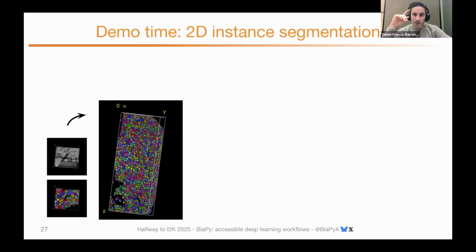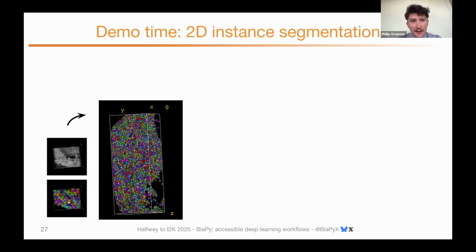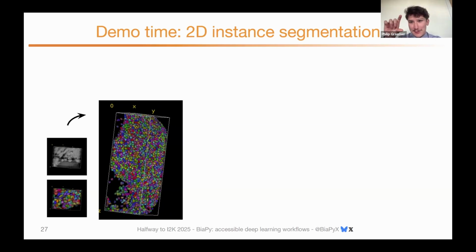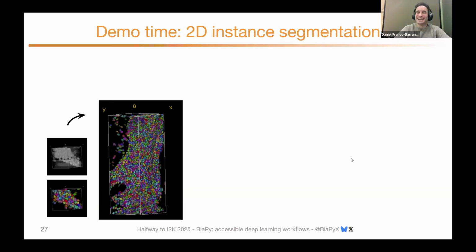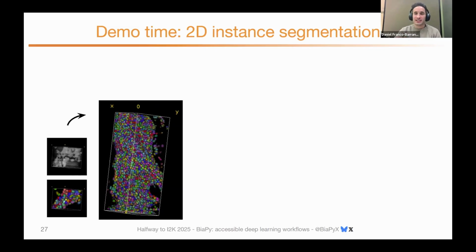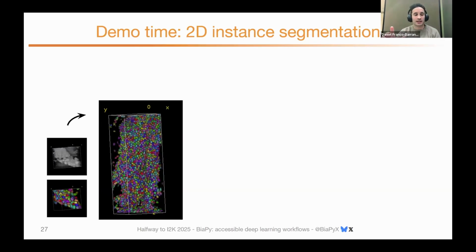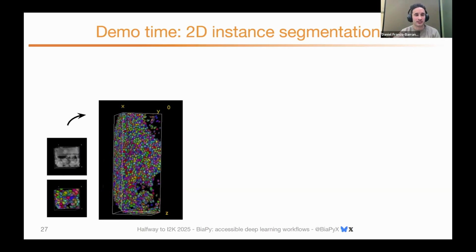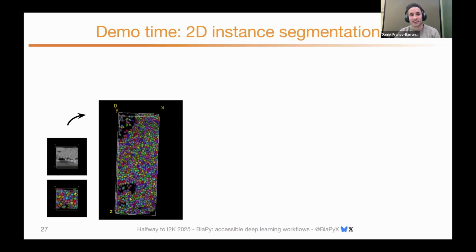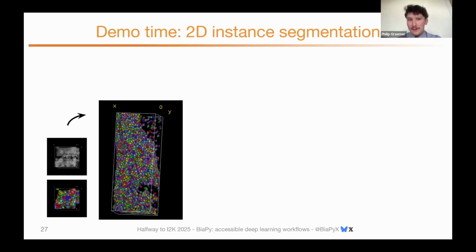Okay. The other question was, when you talked about the unsupervised learning, what backbone do you use there? Because I think I recognize the image that you used with the flamingos is from the Masked Autoencoders paper. Yeah, you're right. We have two options there to pre-train the model. One is modifying the input image, adding noise and crapifying them, let's say. But also we are using the masked autoencoder approach. Okay, cool. Thank you.